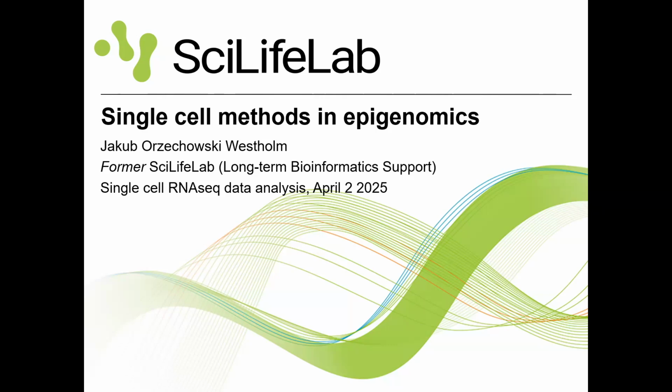For the 10x multiomics, you have from the same nuclei a cell barcode that is incorporated into the tagmented sequence plus the mRNA. So when you do the analysis, when you do the QC, sometimes you have suspicions of a lot of doublets. And you just said that it's very simple in the ATAC-seq data to infer the doublets.